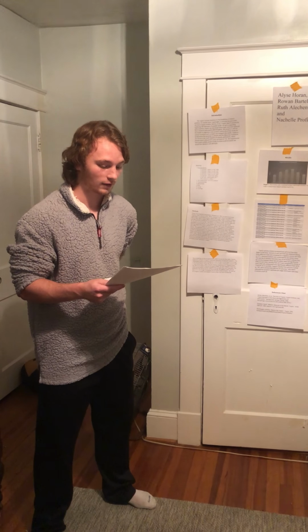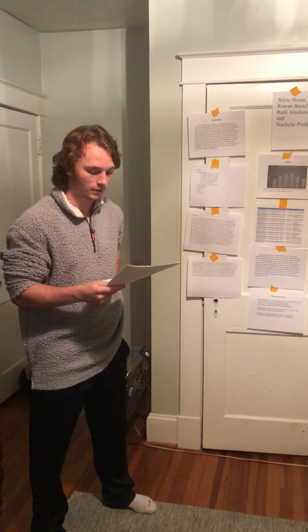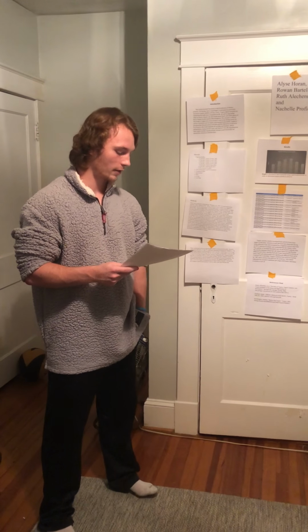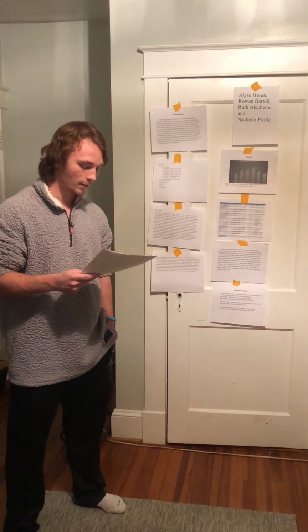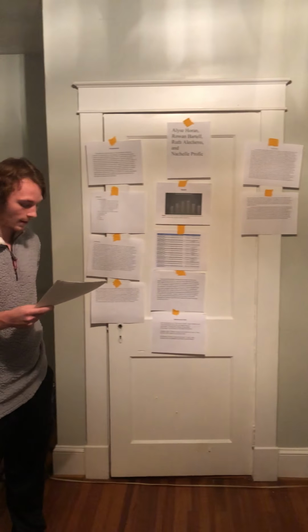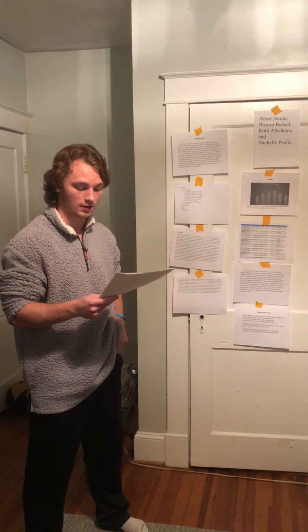Both groups who tested the effect of pH on trypsin activity also used a control variable of 37 degrees Celsius as temperature. Other ways to test trypsin activity are the amount of substance you use, the concentration of a substance, or changing the temperatures at which substances are incubated. The amount of substance used showed substantially lower trypsin activity than other factors, while temperature at 52 degrees reached up to an absorbance of 0.709, along with a salt concentration of 0.075 NaCl showing a maximum absorbance of 0.680.